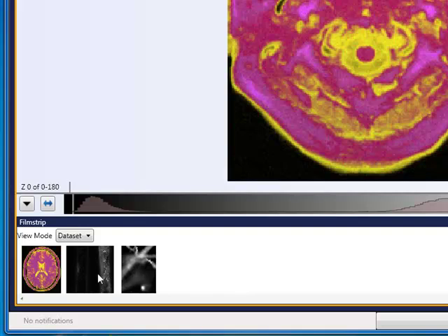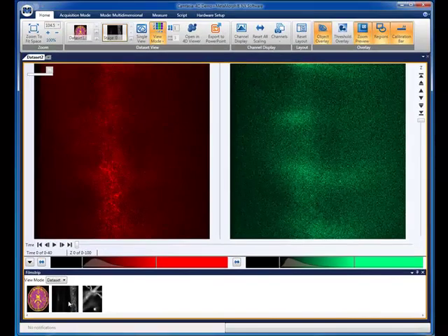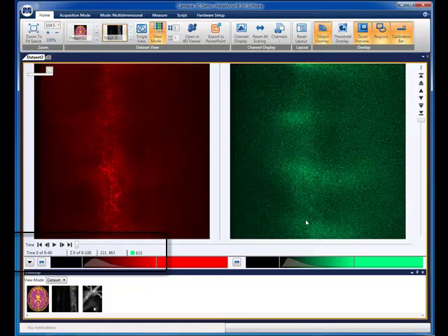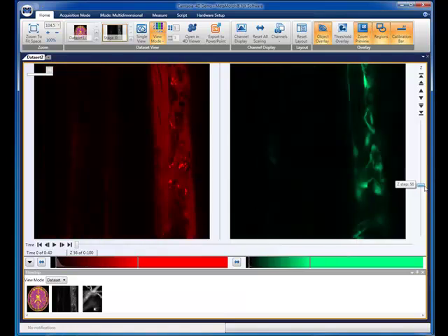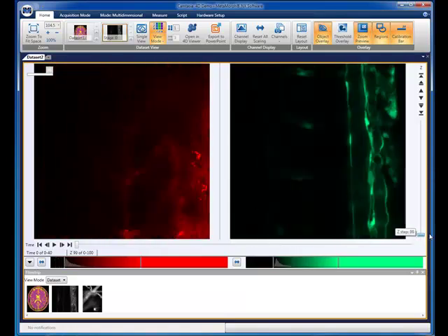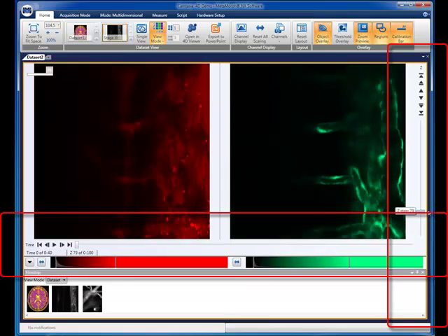Let's load a new data set into the main display. The data is from a zebrafish. It has two fluorescent channels showing the fish's vasculature and blood. We can see from the display that we have 100 z-planes at 40 time points in the sample. From here, we can change how we view the data set, seeing each fluorescent channel separately and using the scroll bars on the side and bottom to scroll through z and time.